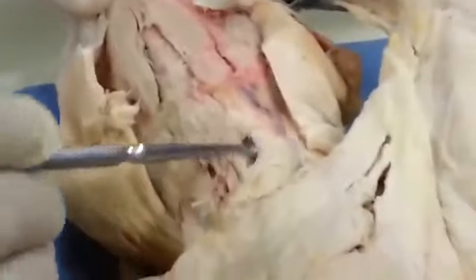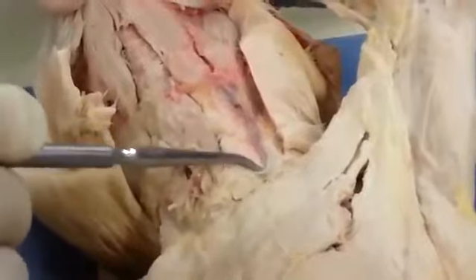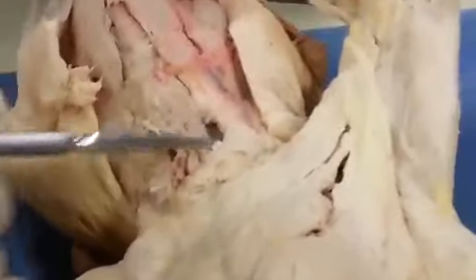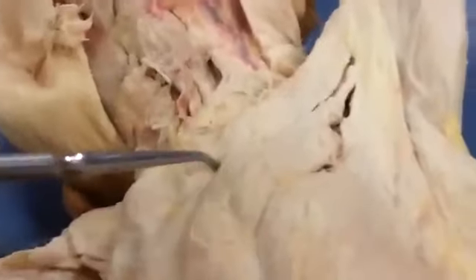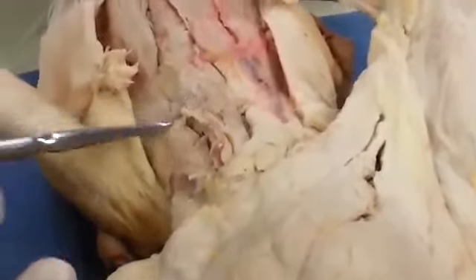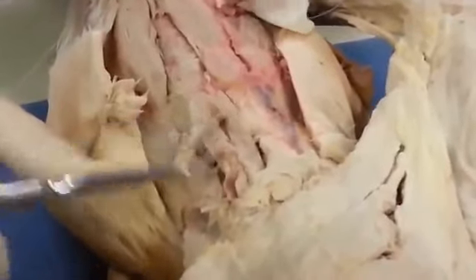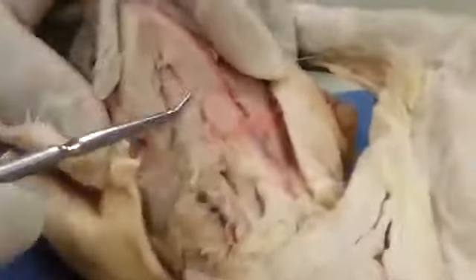As you make your way down to the neck, you're going to have the sternomastoid on the cat, and for the humans, this would be the sternocleidomastoid. The action for these, for bilateral contraction, you're going to have flexion of the neck. For unilateral contraction, it's going to be rotation of the head. And then, as far as identifying, this would be the sternohyoid. So those are the major muscles that you will need to see in the ventral face and neck.